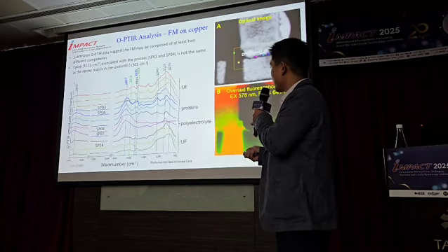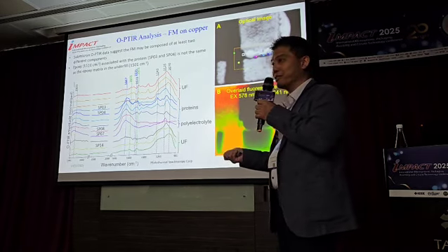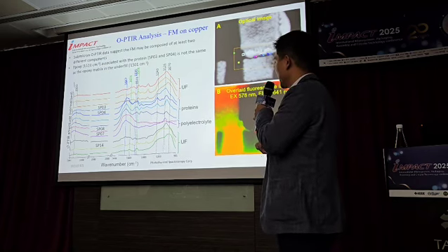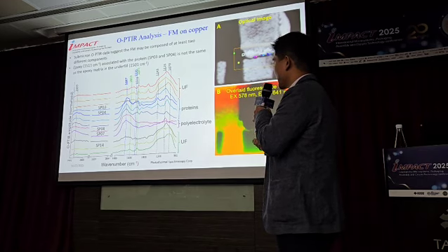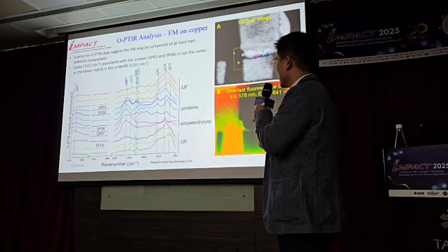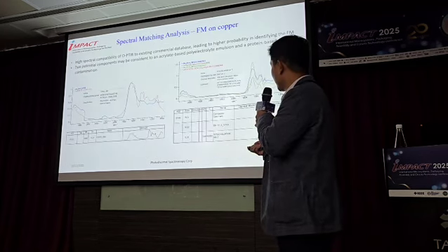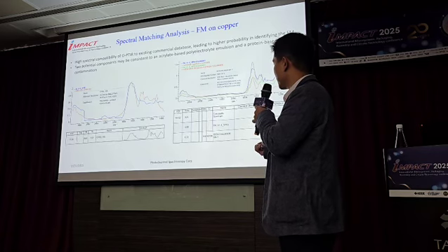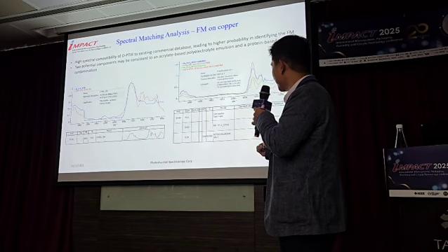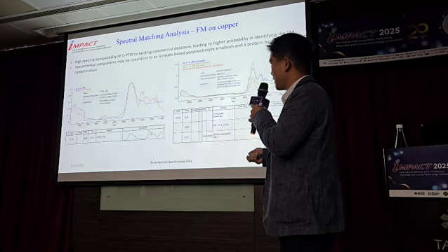And this can all be done within less than 15 seconds, so that makes it a really fast, quick survey view. And finally, before getting to the actual identification of the material, we point our laser beam, the two laser beams, right into that spot, and that will allow us to identify exactly what this contamination is. Based on these absorption bands, we know that it's proteins, and it is actually quite different than the underfill that we see on the side. Now we can plug the data into the database, and we can figure out that this is a protein mixed with another material that is an acrylate emulsion.